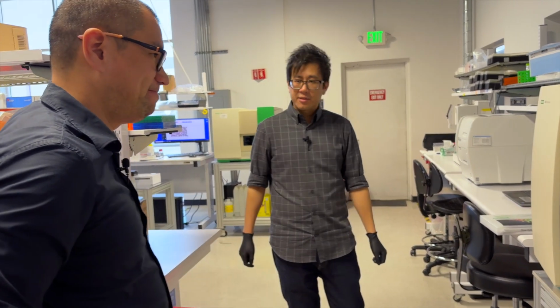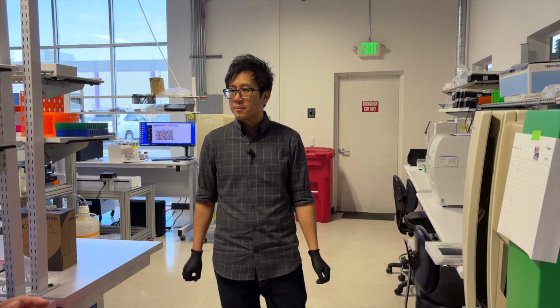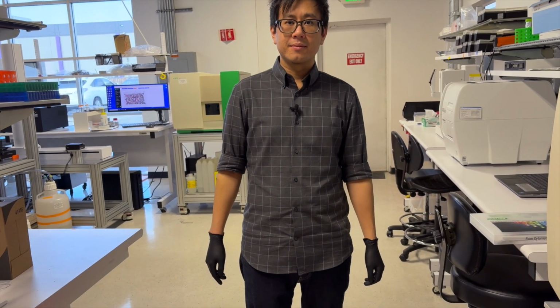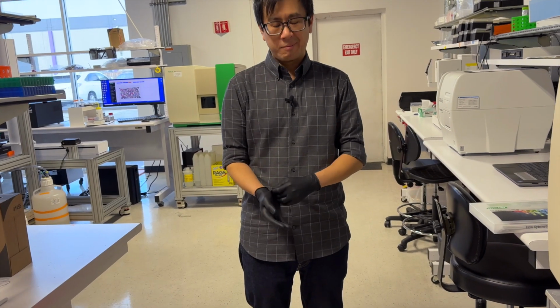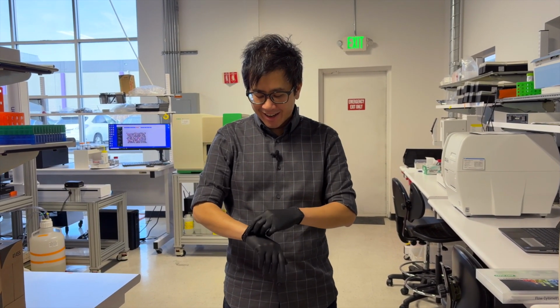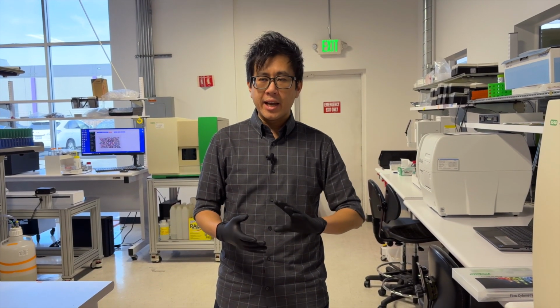Correct, yeah. So Vector is our LIMS, our Laboratory Information Management System, completely built by ourselves. I can give a brief overview of it in a second too. Yeah. I was curious, what's the benefit of building one yourself versus taking something that's available on the market? That is a very good question. And I will say right now, as an engineer myself, and as a company that has decided to build our own LIMS, that not everyone has to build their own LIMS. We did build it ourselves because we had the capability to.